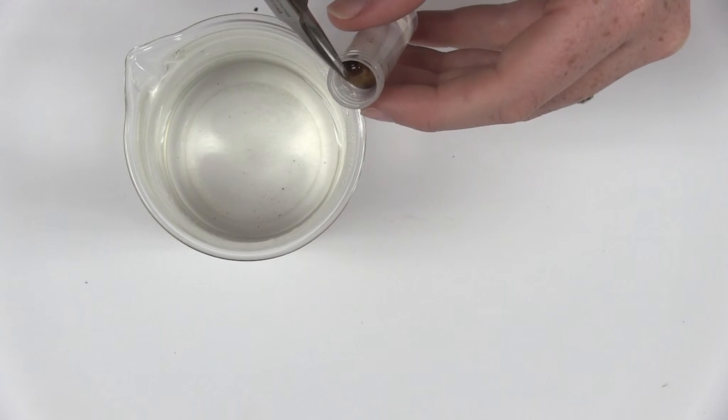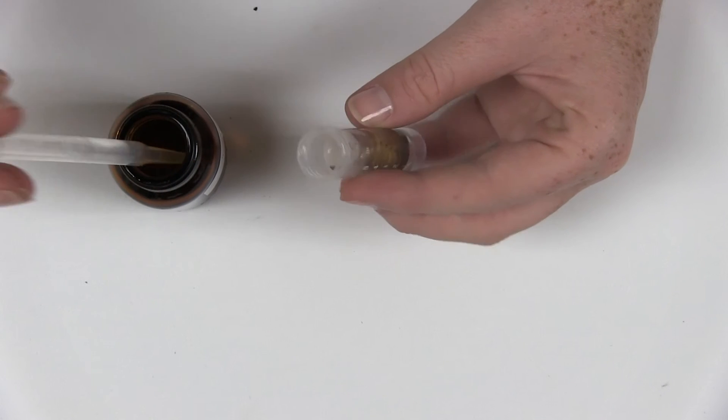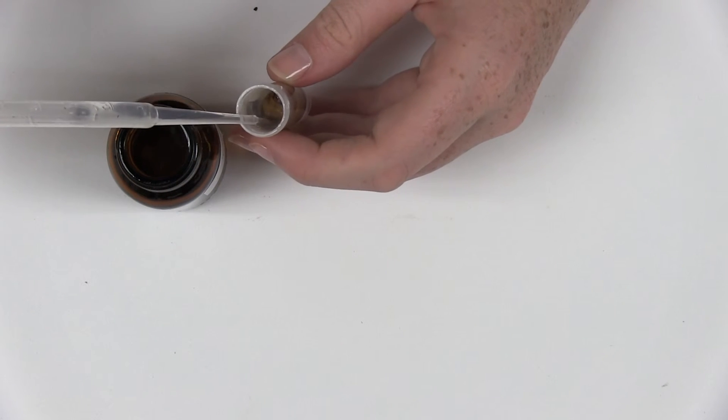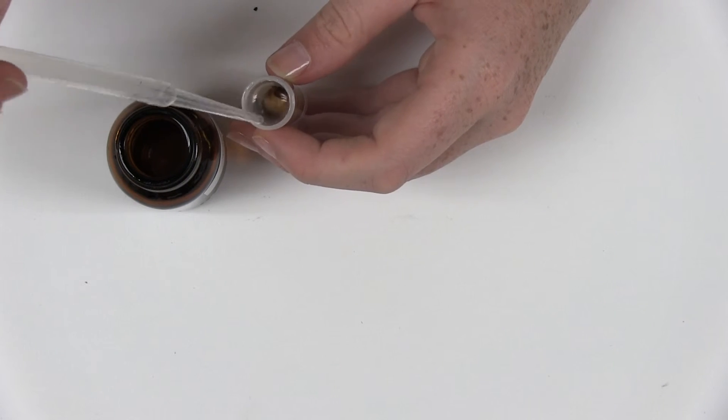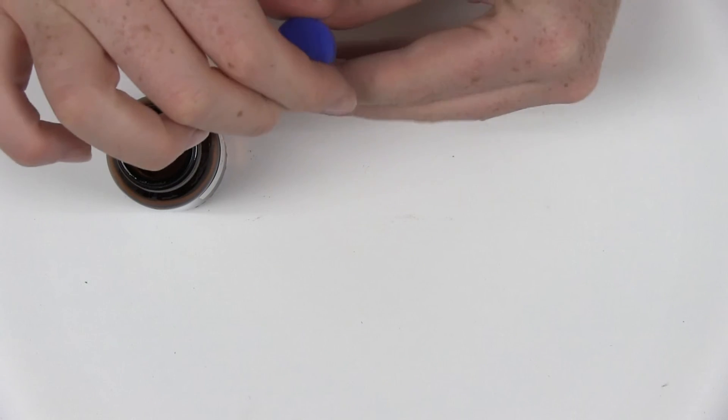Again, use your dropper to add more storage fluid until the grub is completely submerged. Tighten the lid so that the storage fluid will not leak or evaporate over time.